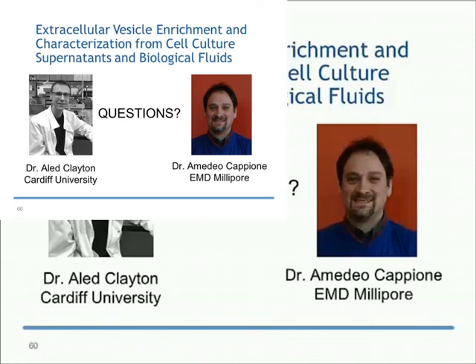We've done some work in the recent past on human plasma from healthy donors and a little bit on plasma from cancer patients' blood. With the column method, which I described in the slide presentation, we typically start with something like 1 to 1.5 mL of plasma, and that goes straight on the column after pre-clearing, of course, to get rid of any debris from the system, such as platelets. From that 1.5 or so mL, we collect fractions which are rich in vesicles, and there's enough material there for us to do the downstream analysis.